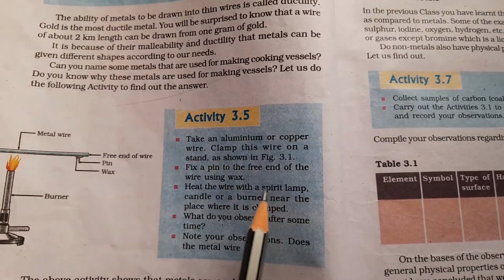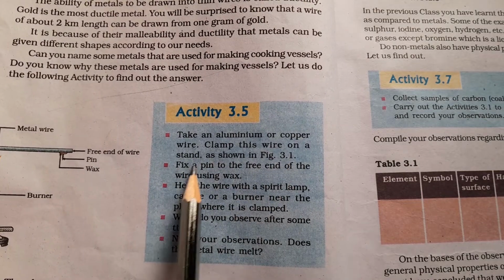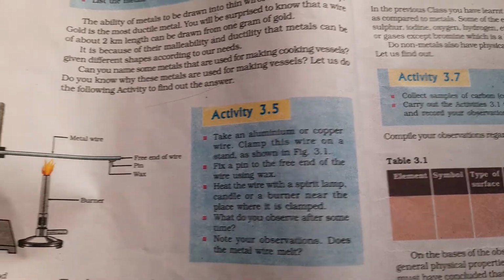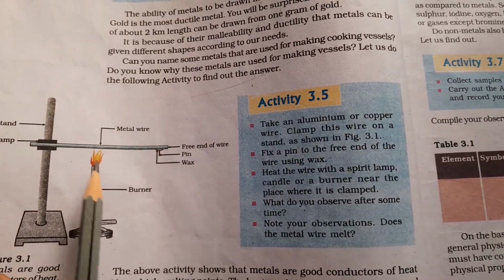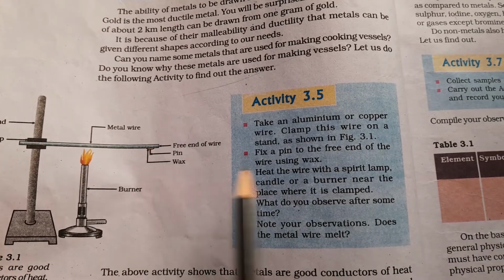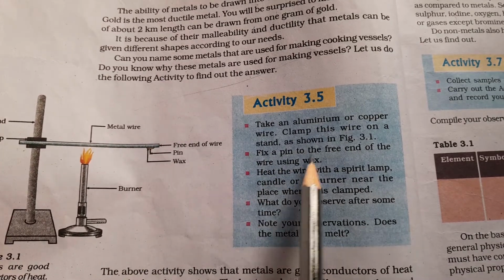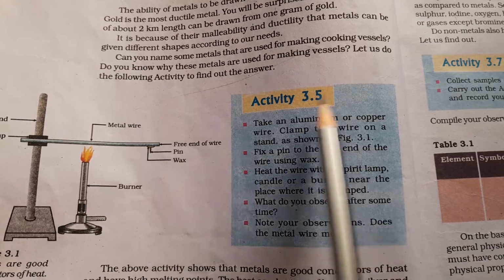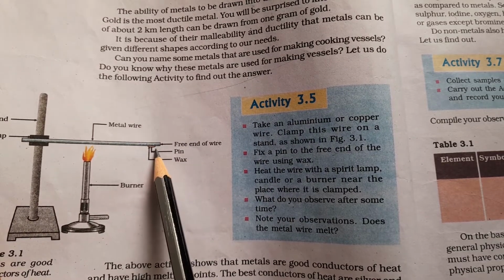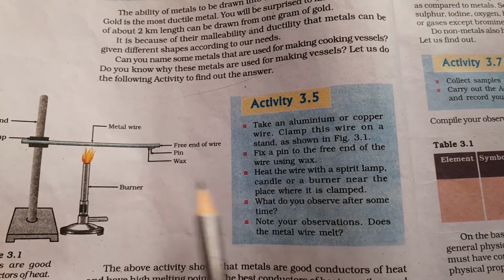So activity 3.5 is: take an aluminum or copper wire and clamp this wire on the stand as shown in the figure. You are going to clamp this wire like this, and fix a pin to the free end of the wire using wax, okay.